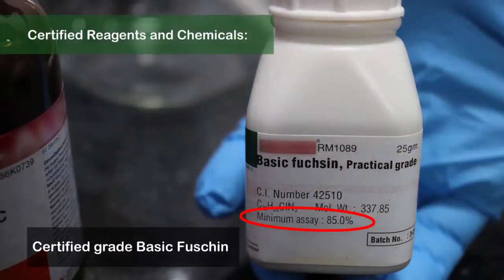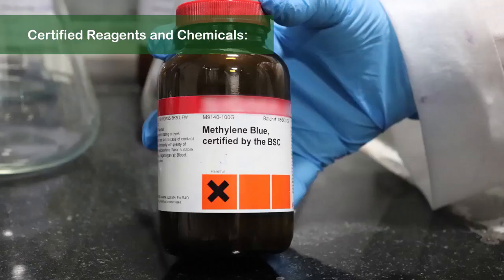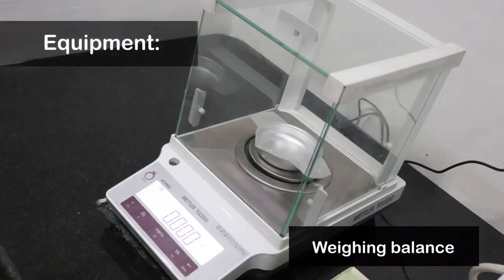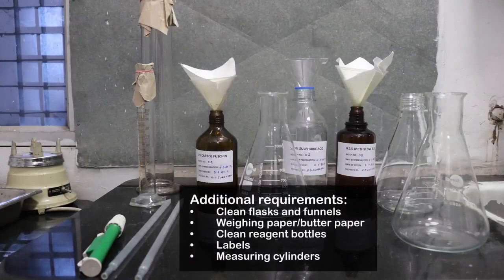Always use certified reagents and chemicals. Do not use tap water for reagent preparation. Ensure the weighing balance is placed on an even surface. Additional requirements include clean flasks and funnels, weighing paper, clean reagent bottles, labels, and measuring cylinders.